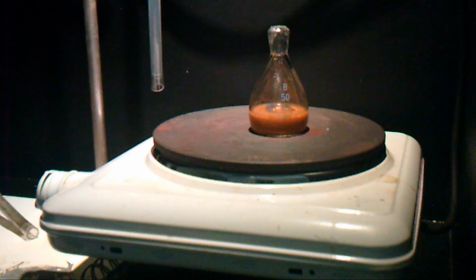We have actually a 50% solution of water and isopropanol in there, so this will keep the para-iodoaniline soluble and also the copper salt. But as it seems, the complex that we make in the end is very not soluble in water and also slightly soluble in isopropanol, so it crystallizes out very fast, as you can see.